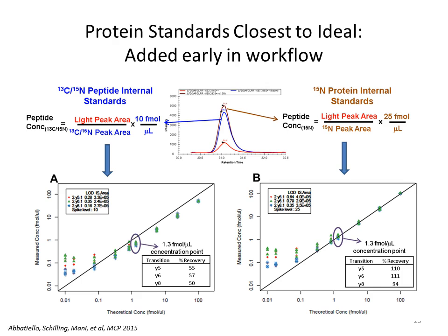So this is an example from that CPTAC study, and we'll go into it with the data file I had asked you to open up. In Skyline, you can have multiple labeled forms of the same peptide. Here, red is usually light, blue is usually heavy, and then the next color, if you have a third form, is brown. Could it be something prettier, Brendan? I mean, brown, anyway.